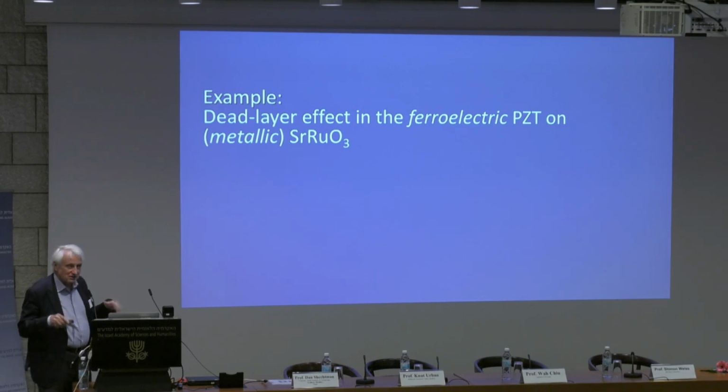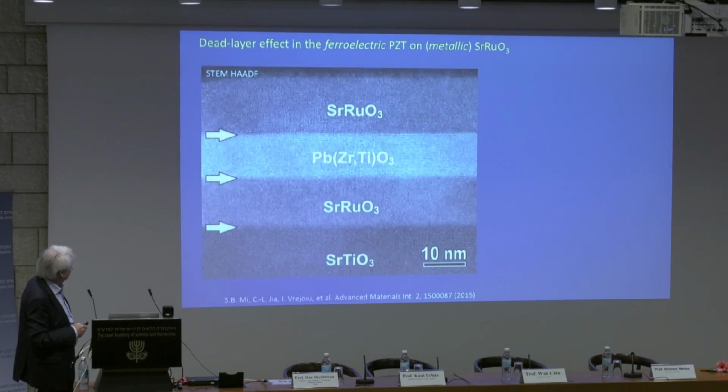The next example is how electron microscopy can contribute to electronic device design. And here we talk about capacitors as sandwiches of lead zirconate titanate sandwiched between two strontium ruthenate electrodes. The width here is about 10 nanometers.